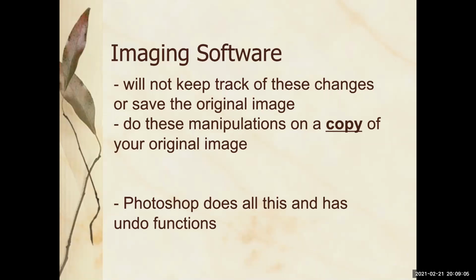Photoshop does keep track of changes and all of that. It's wonderful for that, but mostly we don't teach it to you because it's expensive, and we're trying to change that. We're trying to work on that. If you are working in a professional lab, they'll probably have a license. But to be honest, it's good to know how to do these things in Fiji because everybody has Fiji. And there are a lot of really great lab situations where they're doing good work, but they just don't have money for a license.